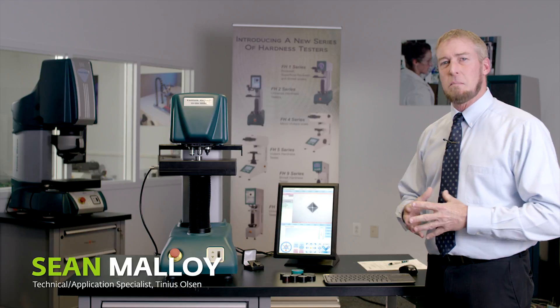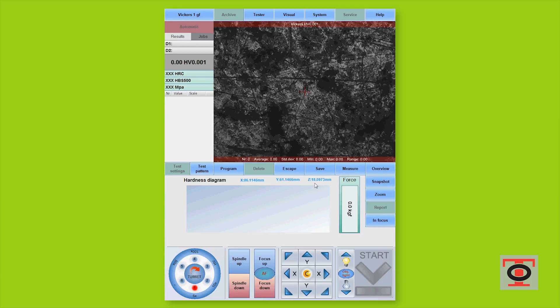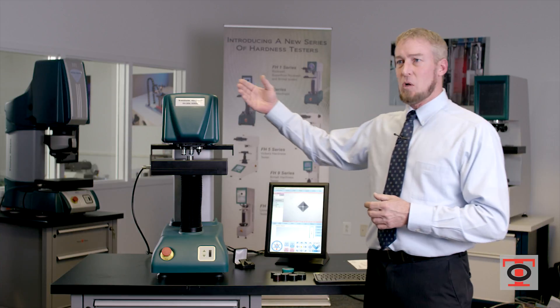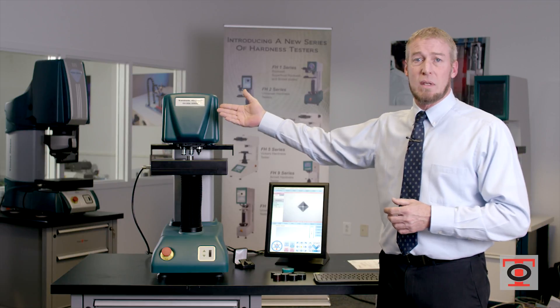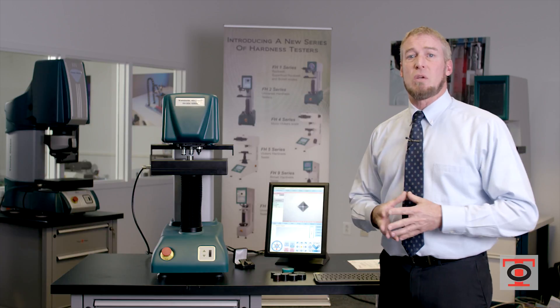What I want to show you is some of the different things that make things easy. When you're setting up any Vickers or new test, you must be in focus prior to performing a test. You have several different ways of creating this focus. The old way was looking through a microscope set on the tester. So if you have glasses or you're required to have glasses for your lab, these things will inhibit getting a good focus from the start.